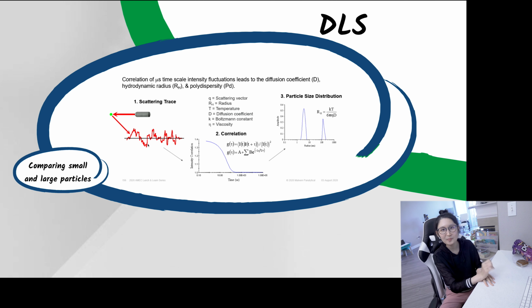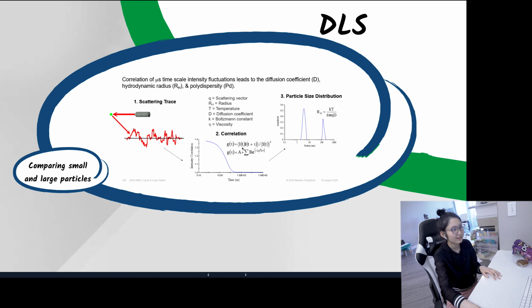Feel free to learn more about the autocorrelation function, but for the scope of this presentation, we just treat it as math, and the computer handles all the math. From the scattered light intensity, where I here means intensity, we calculate this autocorrelation function, and by regression of this autocorrelation function, we can calculate this parameter D here, which is the diffusion coefficient.